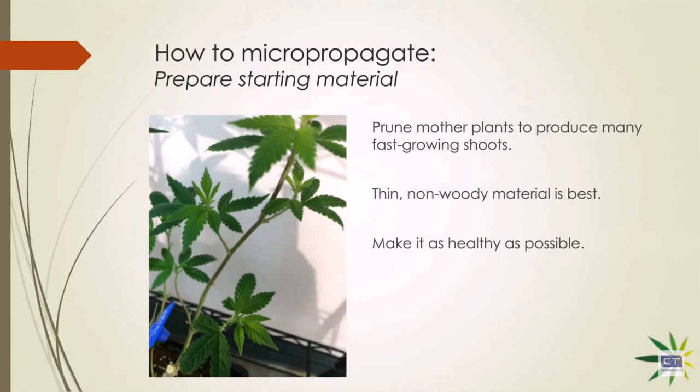How you prepare that starting material is you harvest it, you cut it, bleach it, and you rinse it under very, very clean conditions. I'll talk a little bit more about that later. If there are questions about what I mean, that's something I'm going to cover later, but I think it warrants a separate discussion of its own, so I'm going to put a pin in that. All right. Sure.